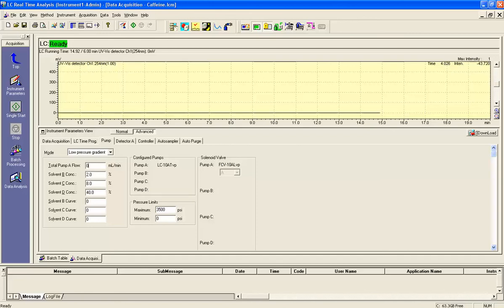Remember, we said that you probably won't see anything lower than a 0.500, and you probably won't find anything higher than a 1.500. Okay, so because of that, if I go back and I change this to, let's say, 0.75, well, let's say that's what my handout tells me to do. It tells me this is your flow rate. You want to make sure that your flow rate is set, and there it is, 0.75.